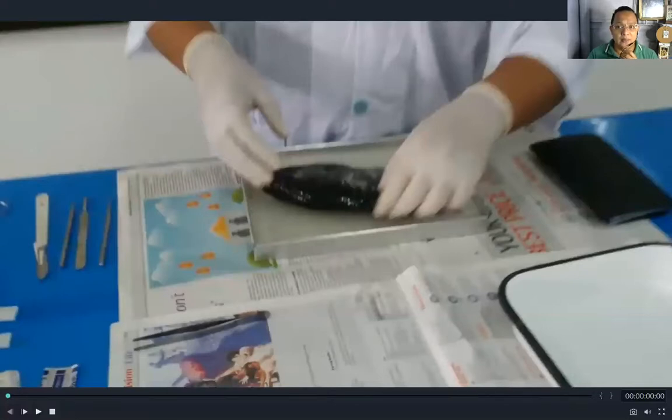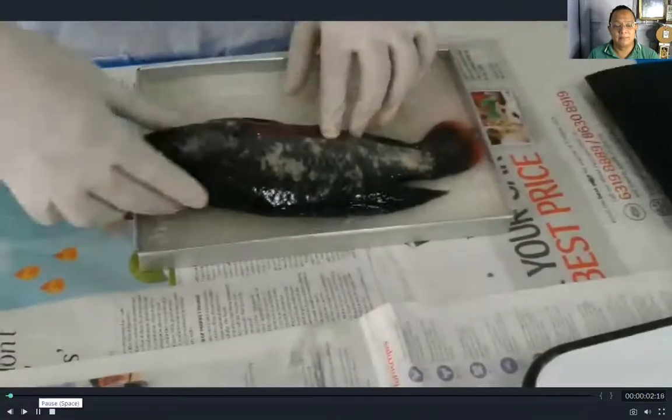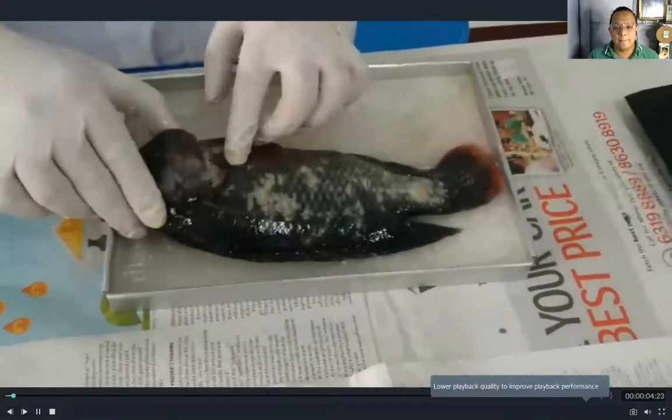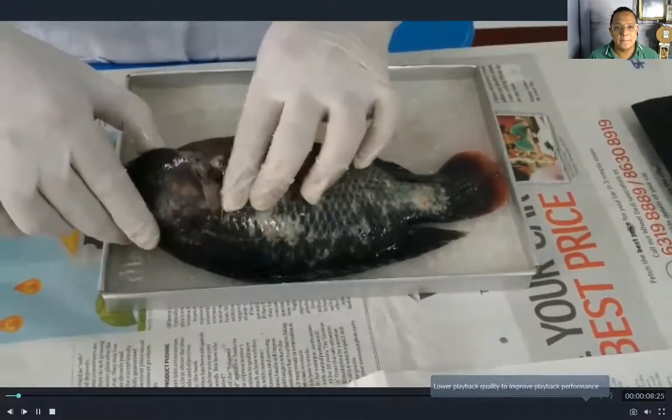I will show you the video of how to dissect properly and to discuss the different external and internal parts of the fish. So now, this is the operculum. The operculum covers the gills of the fish.